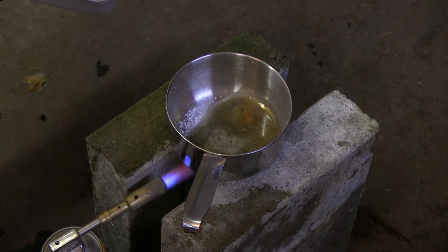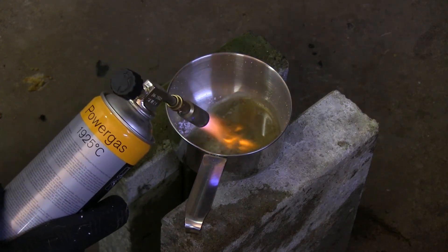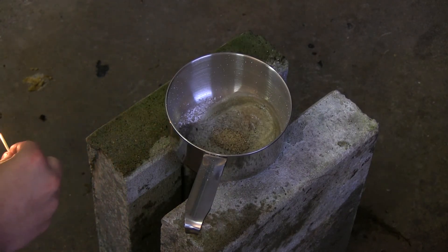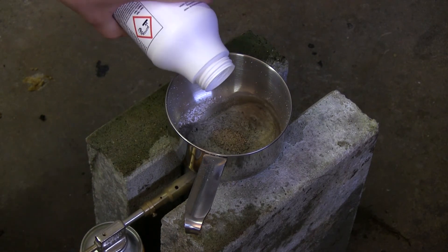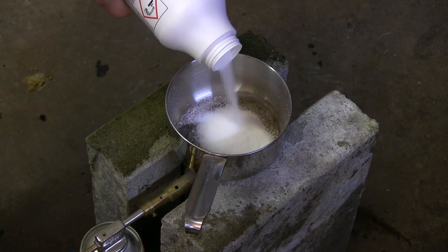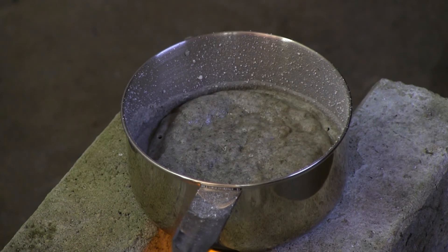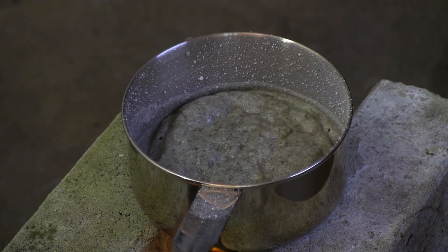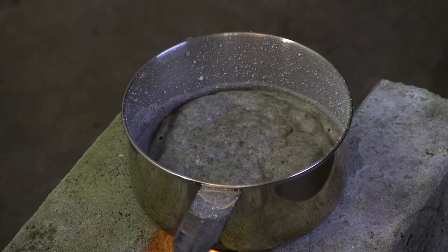After heating the reaction a bit more, I decided to add more sand to it. After heating the reaction mixture for a while, I decided to add a lot more sand. The reaction seemed to halt, so I decided to add some more sodium hydroxide. After barely managing to melt that down, I added some more sand — that was a bit of a mistake, because now I had a lot of sand and sodium hydroxide that I couldn't keep warm enough with only the blowtorch.